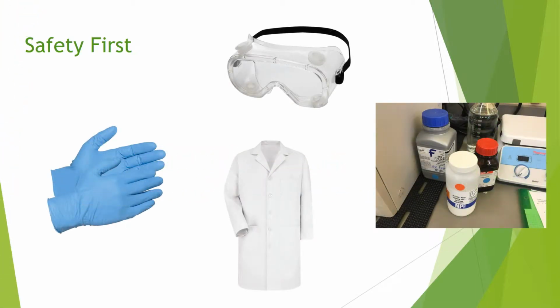It was important that we took safety precautions while performing this experiment. To avoid accidents, necessary personal protective equipment such as gloves, safety goggles, and a lab coat should be worn in the lab at all times. If tartrazine or calcium chloride comes into contact with skin or eyes, rinse under water for 15 minutes. It was also important to dispose of chemicals to their respective waste containers.